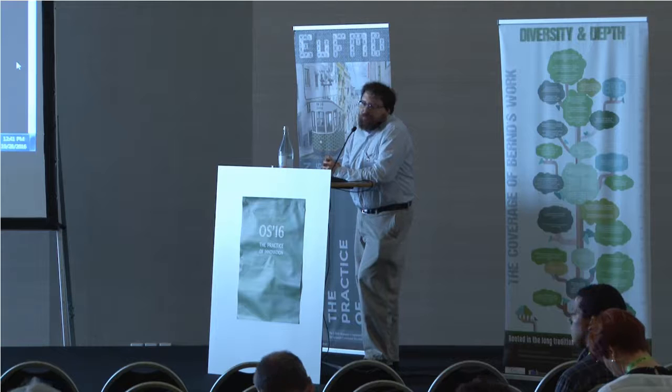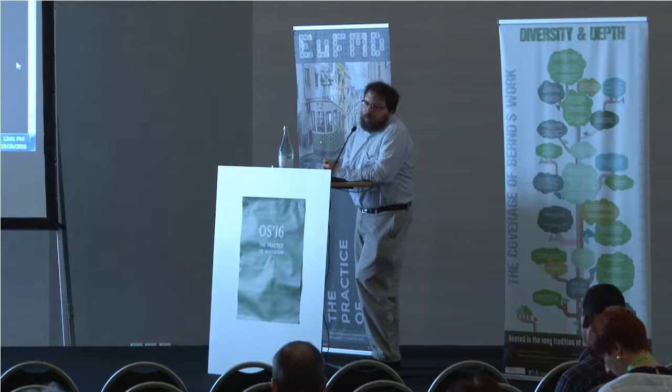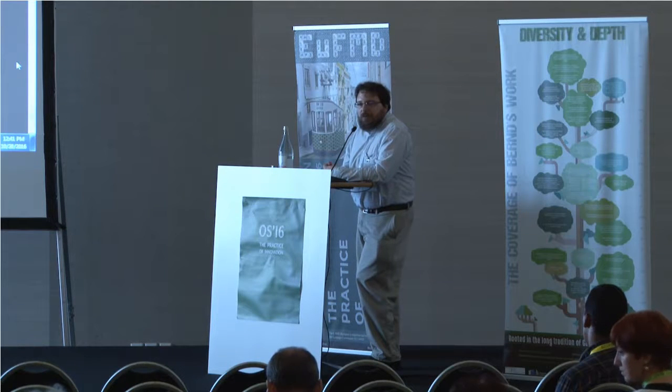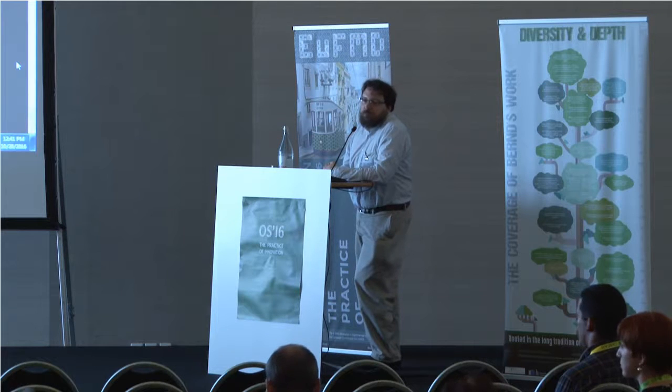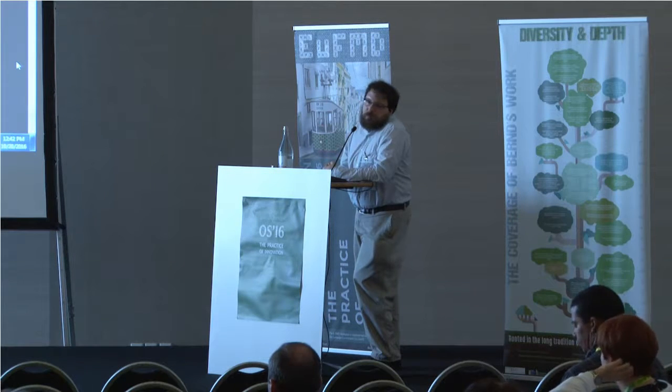There's another question. Yes, did I get properly that we will have access to all your 7,000 sequences? Will it be available to the general public? Well, I cannot answer this question, but at the moment the sequences cannot be accessed. They are used by the pipelines, but you cannot download them. This is what I've been told to do and what I did. And we can also upload our sequences in your system and see where they fit in your trees. That's right. And also you can get the metadata information, like geolocation and these kinds of things.